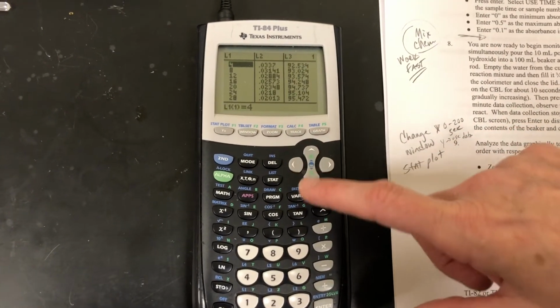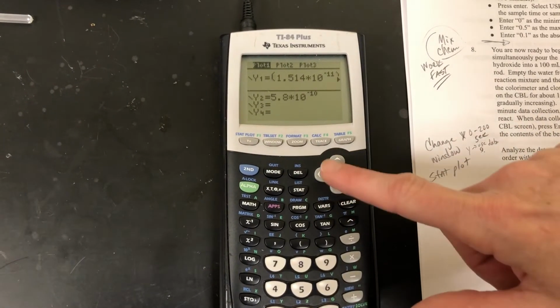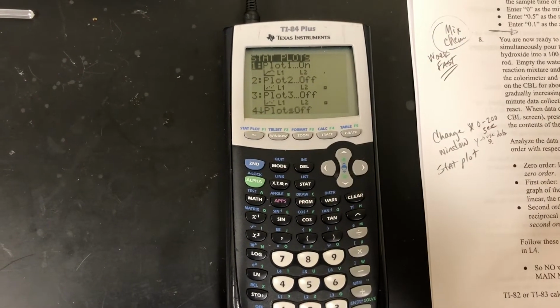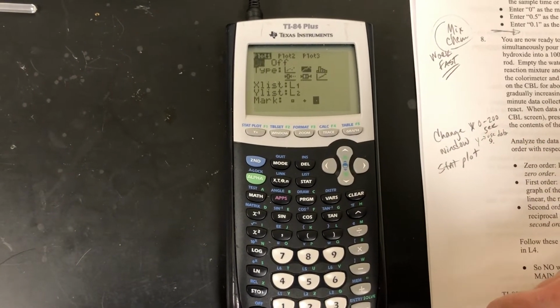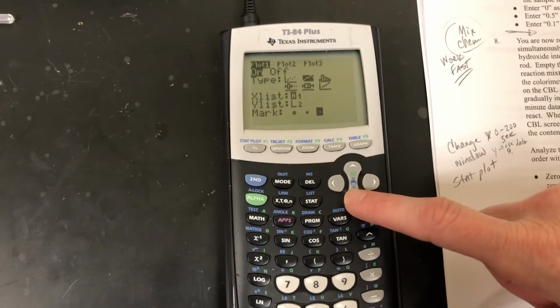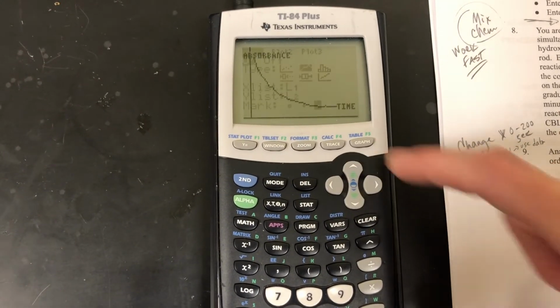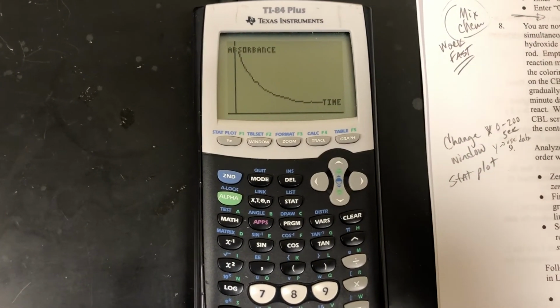To plot it, what we're going to do is go to stat plot. Oops, excuse me, I went to y equals. We'll just go ahead and clear these values. Okay, so I need to go second y equals. And right now, plot 1 is on. If we check that out, it is getting the x value from L1, which is our time, the y value from L2, which is our concentration. So all that looks good. So now if we hit graph, that's graphing our absorbance versus time, and we can tell it's not linear.